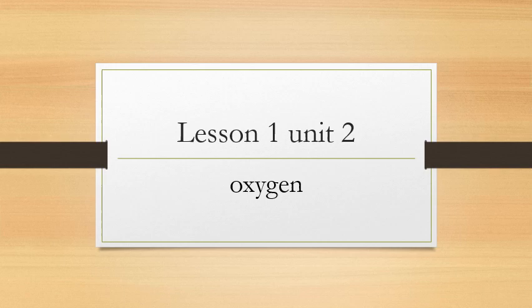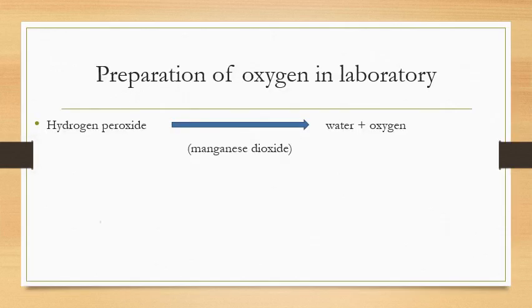Hello primary 6 student. In this video we will see how we can prepare oxygen gas in the lab and also know what the properties of oxygen gas are based on some experiments. First we need to prepare our chemicals and lab tools.